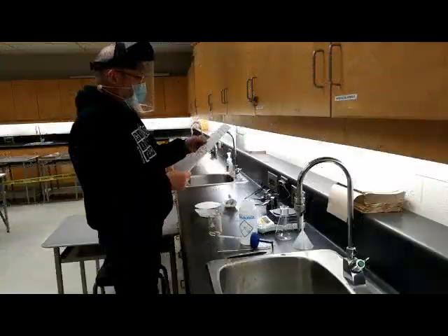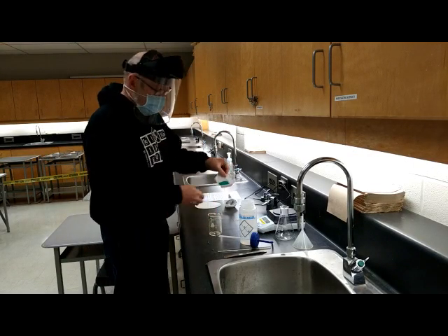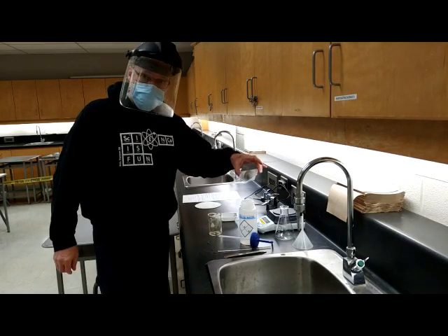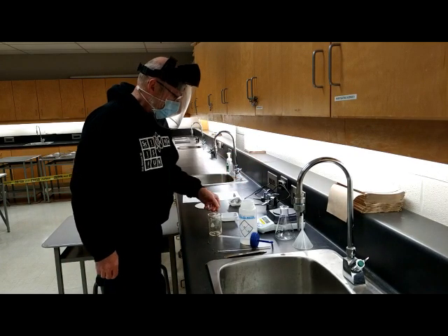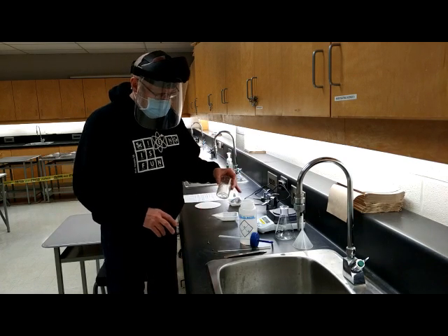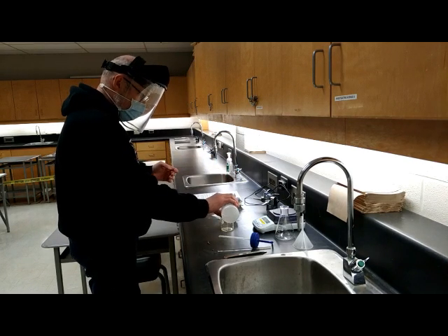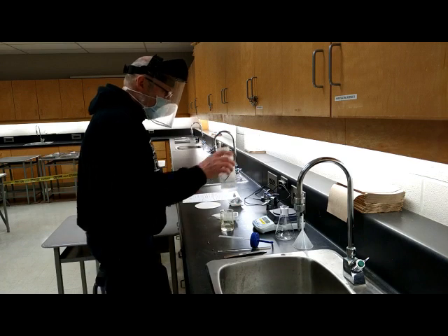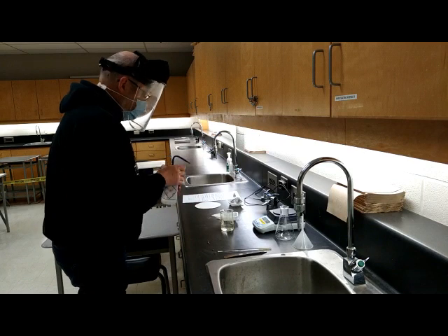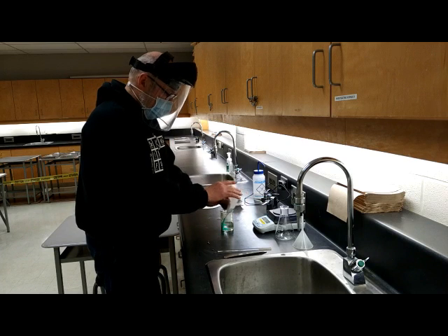Our overall mass for the filter paper, 1.44 grams. The first thing that we need to do is, since we've already measured out our materials, we have the right amount of the copper-2 chloride, we have the 1.00 grams of iron from the steel wool. And so now the first thing we have to do is take our 150 ml beaker, and I'm going to add about 50 or 60 milliliters of water. So that's that one. And then we're going to dissolve the copper-2 chloride into the beaker. So that's going in there.